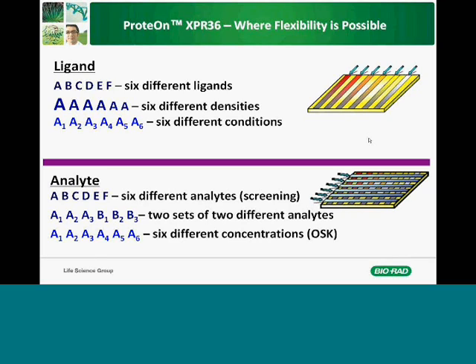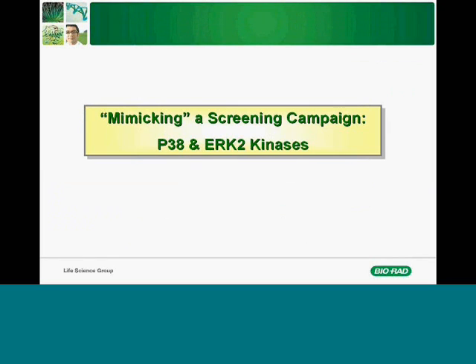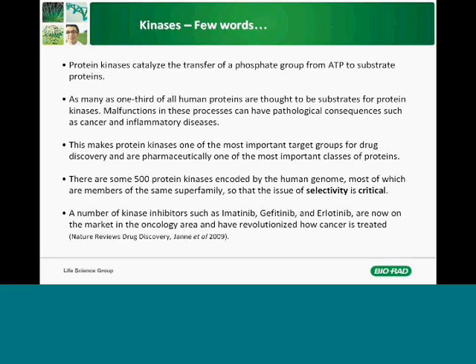So, the first results I want to share with you are from the screening campaign. We try to mimic here a small-scale screening campaign of inhibitors against P38 alpha and ERK2. And just before we start, a few general words about kinases. Probably some of you know, or all of you know, but just to give the flavor of their importance.